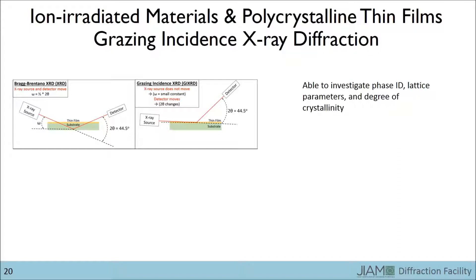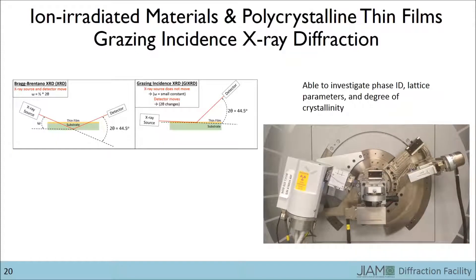In a moment I'll show you a real example of data collection from 40 to 50 degrees 2 theta using both Bragg-Brentano and grazing incidence configurations. But first I'd like to point out some of the different parts of the diffractometer. On the left is the X-ray source and on the right is the detector. In the center is the sample.